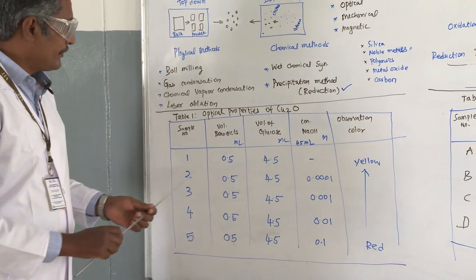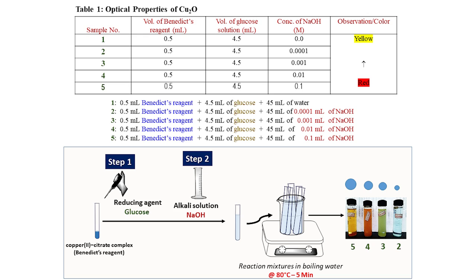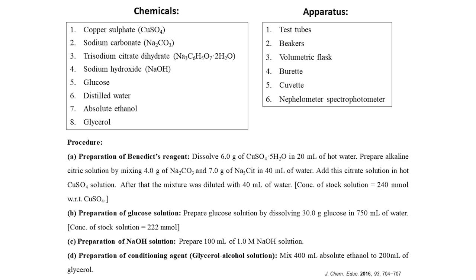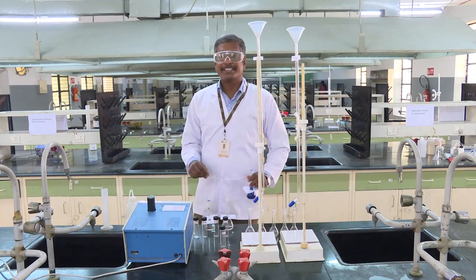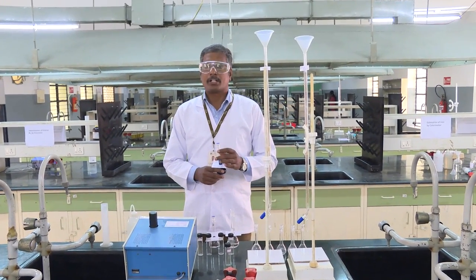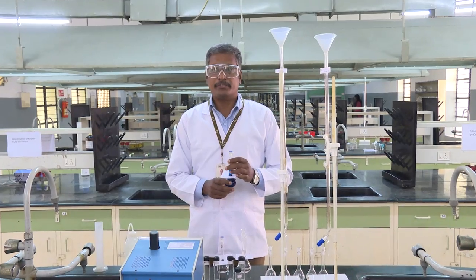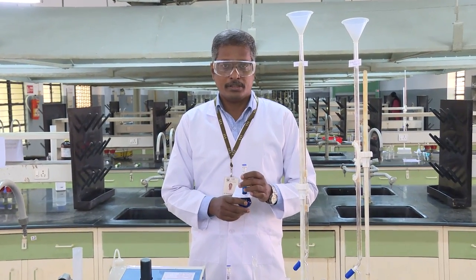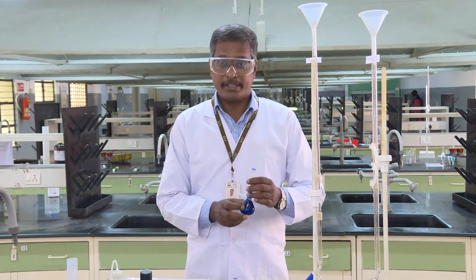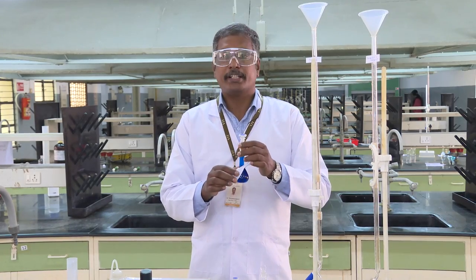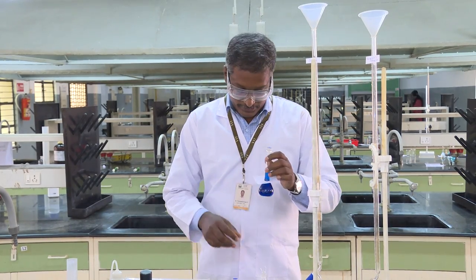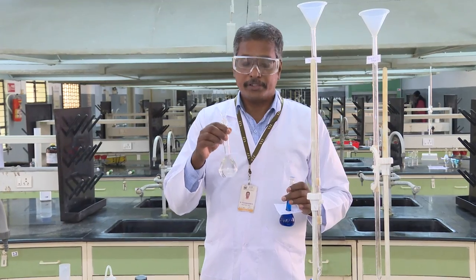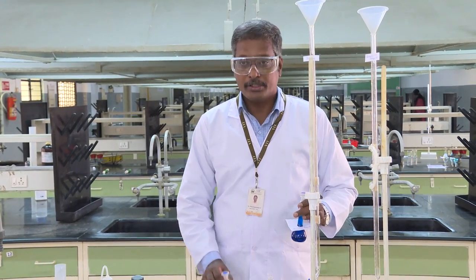What we need is a Benedict solution — which is a bluish color — a glucose solution, and sodium hydroxide solution of various concentrations. Let us start the first part of the copper oxide nanoparticle synthesis involving optical measurement by naked eye. For that we need a stock solution of Benedict, sugar solution as reducing agent, and sodium hydroxide.